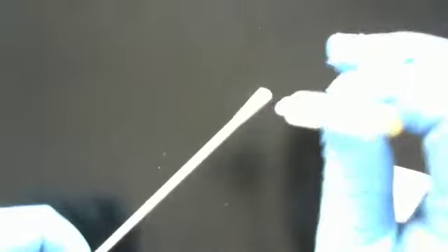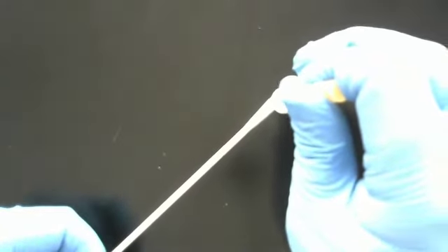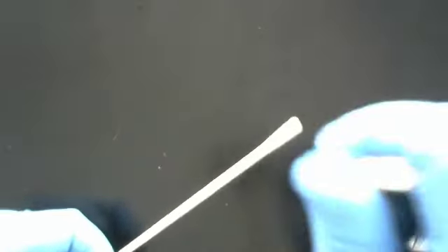And this is no bacteria. It's a yellow color. Next up, Proteus.